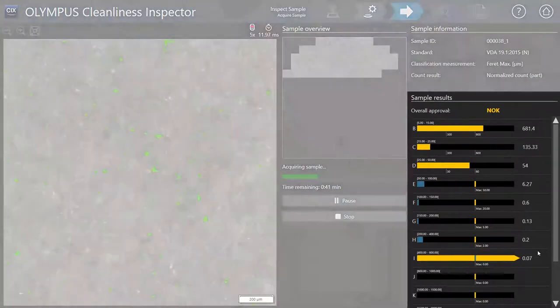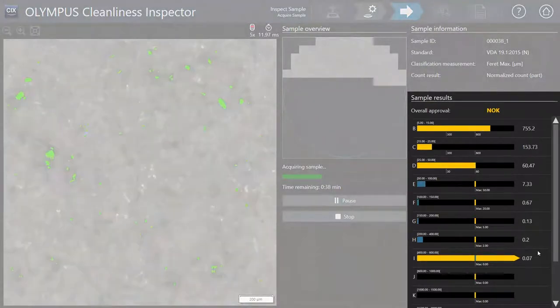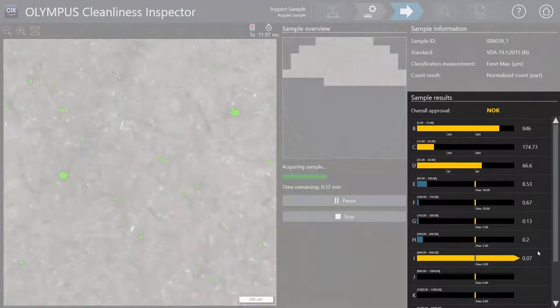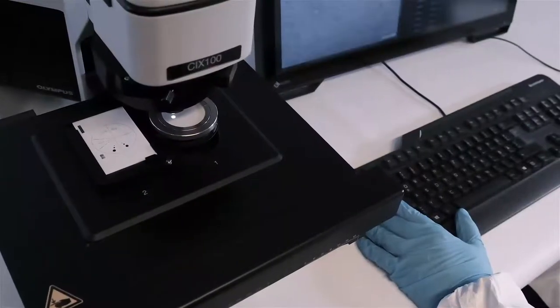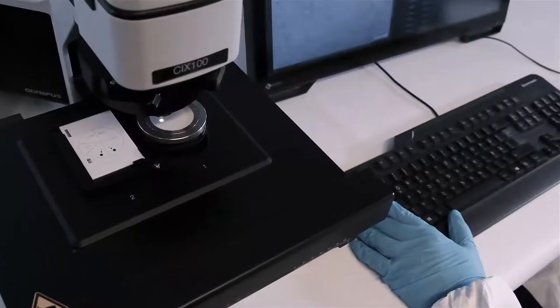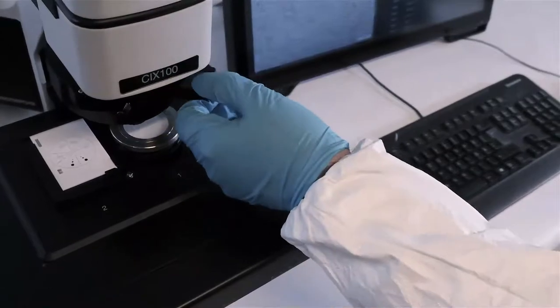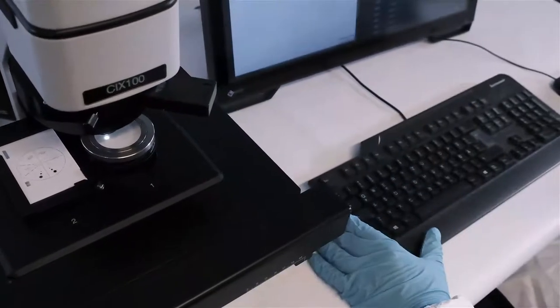Live analysis and direct result feedback enable user interface at any time. Real-time decision-making for reprocessing helps ensure a fast reaction time in case of a failed test.